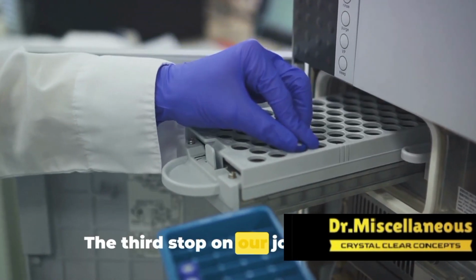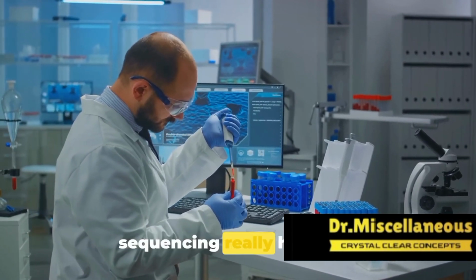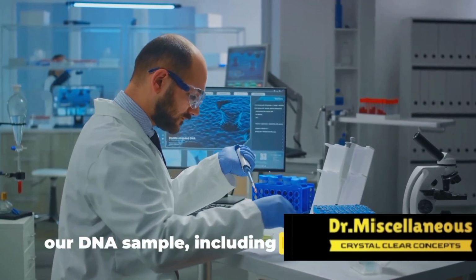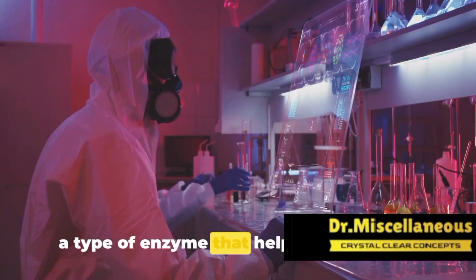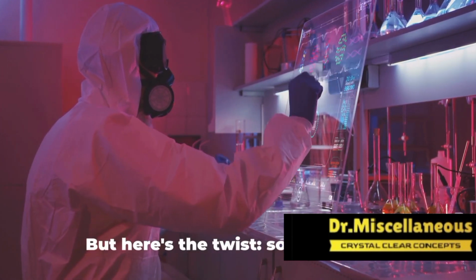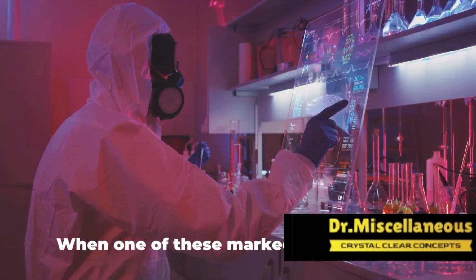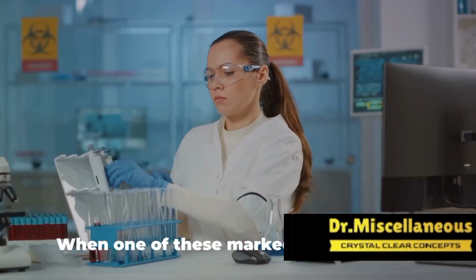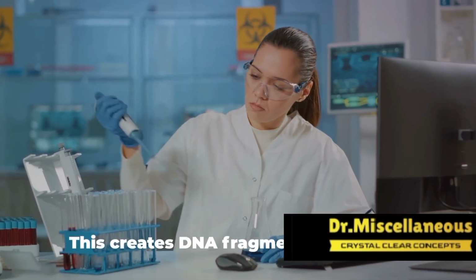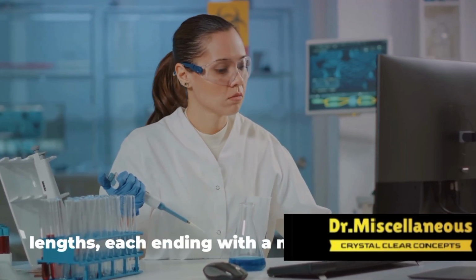The third stop on our journey is the sequencing reaction. This is where the magic of Sanger sequencing really happens. We add a special mix of ingredients to our DNA sample, including DNA polymerase, a type of enzyme that helps to build DNA molecules and nucleotides, the building blocks of DNA. But here's the twist. Some of these nucleotides are specially marked. When one of these marked nucleotides is incorporated into the DNA strand, the building process stops. This creates DNA fragments of varying lengths, each ending with a marked nucleotide.